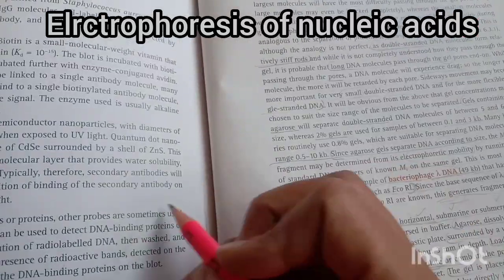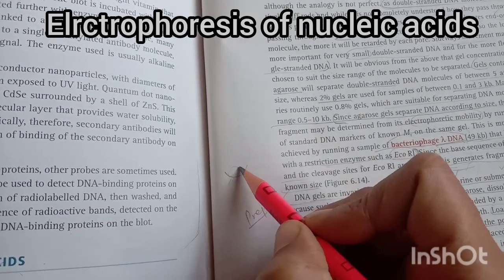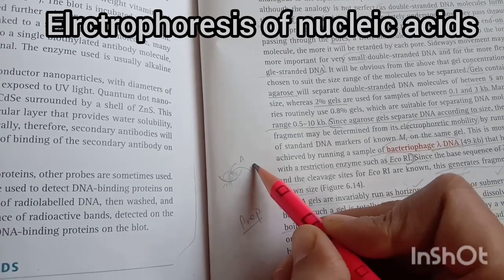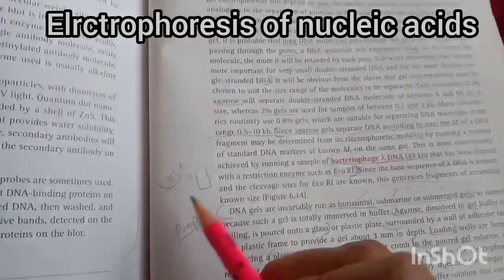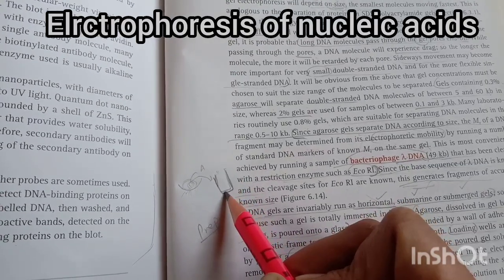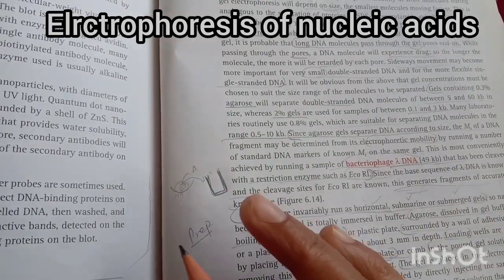One minute. So here we are boiling the agarose gel. Firstly, we dissolve the agarose in buffer by boiling, and then after that it is poured onto the glass, okay? This glass was surrounded by adhesive tape. This is the adhesive tape, okay? So we can use adhesive tape here, okay?